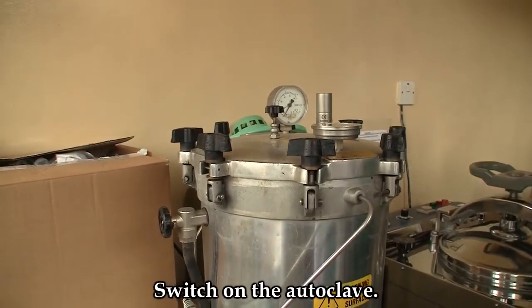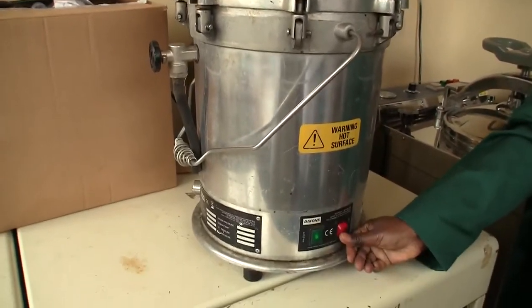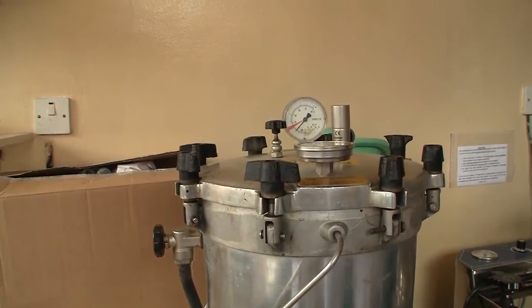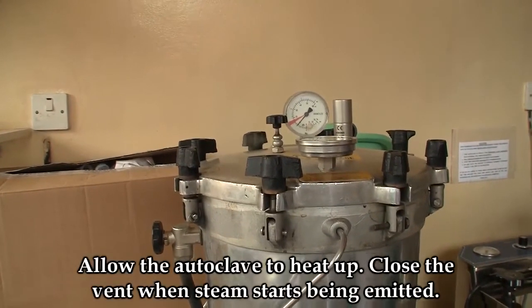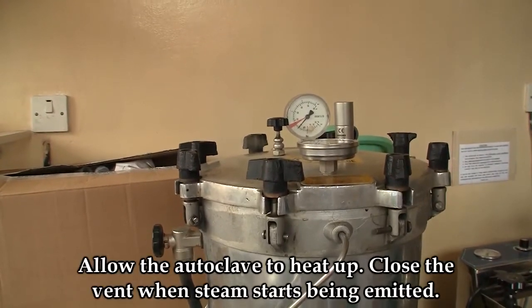Then switch the autoclave on. Allow the autoclave to heat up, and once the vent brings out steam, close it.